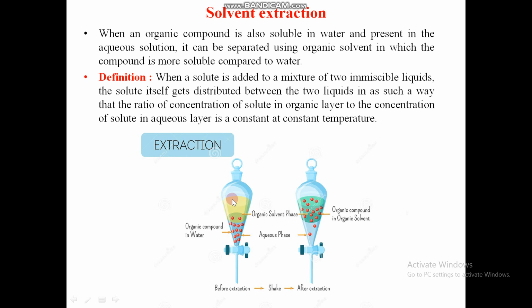When we add a suitable organic solvent in a separating funnel and shake it, all the organic compounds present in the aqueous phase start to move towards the organic solvent, because, as we already said, the compound is more soluble in the organic solvent compared to water. From this technique we can extract the compound from the aqueous solution. This is nothing but solvent extraction.